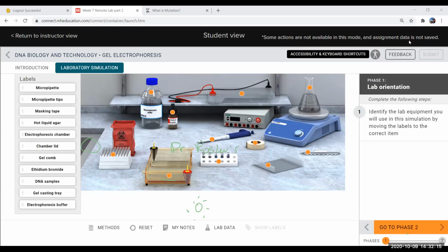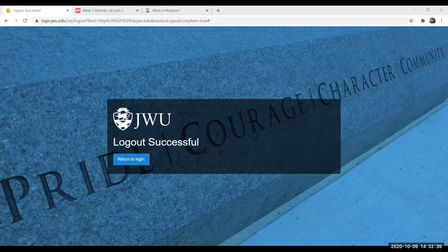So I'm going to pull up the lab template on my side. That one figure that you generated is going to ultimately go into the results section. There's not a lot of information in this lab that's going to go in the results, but that one picture of the gel that you just took, hopefully you can cut, paste, and crop it into the results. You need to have a figure legend underneath it that explains what patient 1, 2, and 3 ultimately are. So if you figured out that patient 1 has this TNF alpha form, patient 2 has that TNF alpha form, and patient 3, tell us that in the figure legend in the results section.